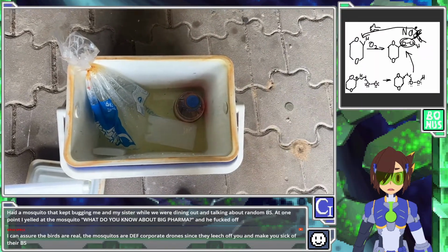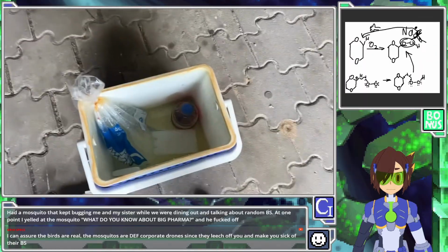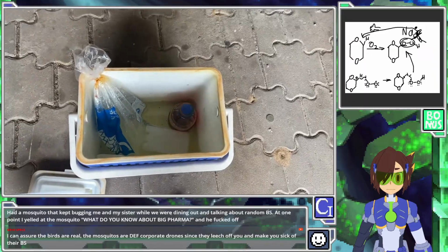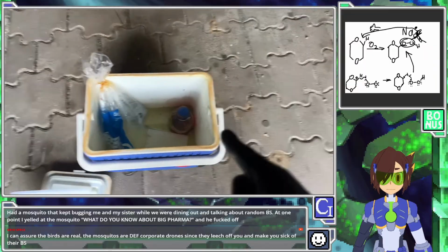Yeah, it's possible. You don't want to overpressurize in the hot Australian sun. If it builds up in a flask and the stopper shoots off, then all the bromine will just be lost, and I would come back here to a very, very orange and corroded esky and be very sad about it. That didn't happen, so let's go on with processing the bromine. Hell yeah, we get to distill the bromine, which looks fantastic.